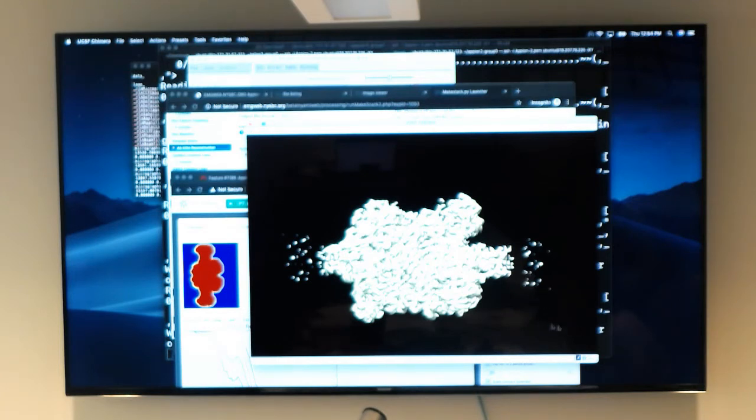All right, so the hope is that you have a regime where you might have multiple conformations, but they're defined states. It might be something called semantics, but it really matters, because if something is truly floppy, let's say a loop, completely disordered, completely random, then you may not be able to use standard structural biology approaches to look at it unless you artificially lock it in, which may be informative, may not be.